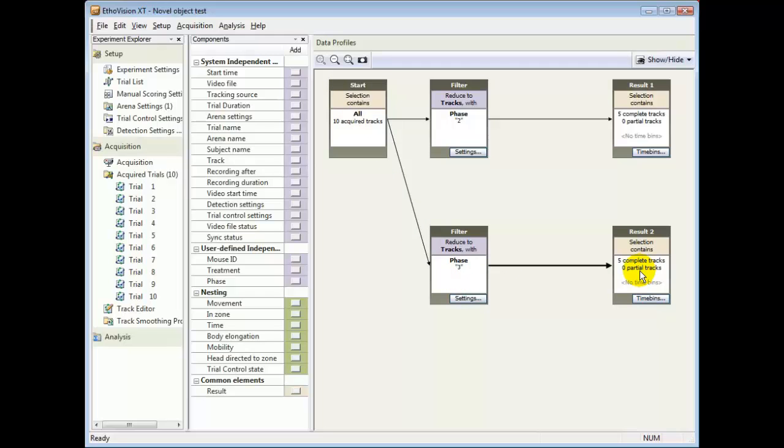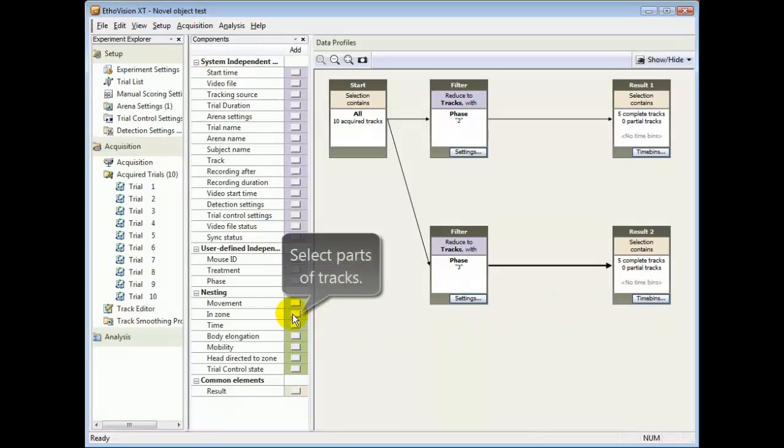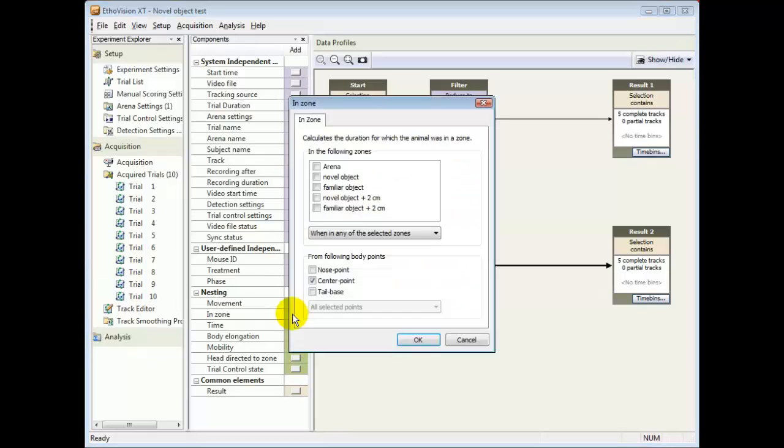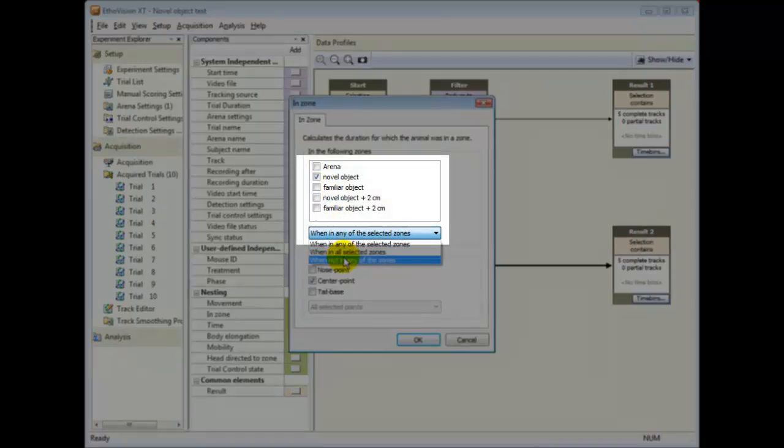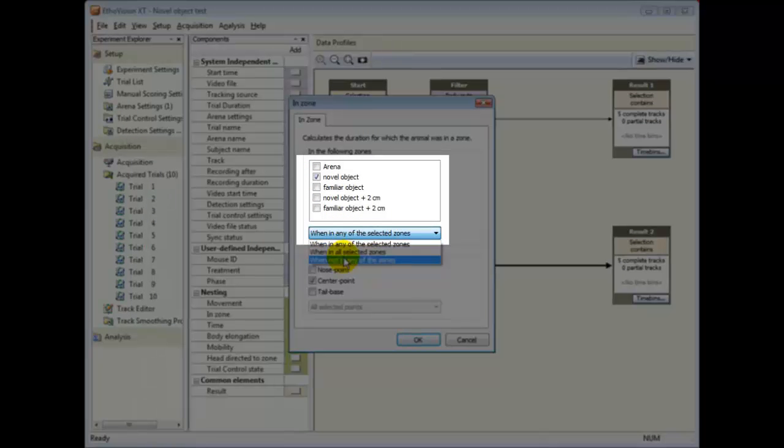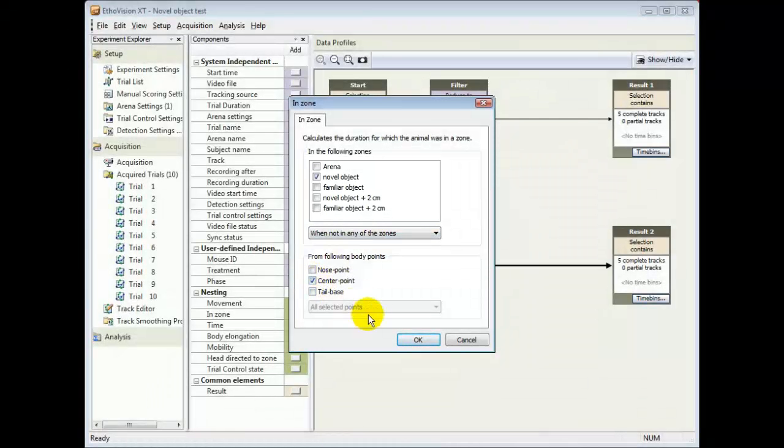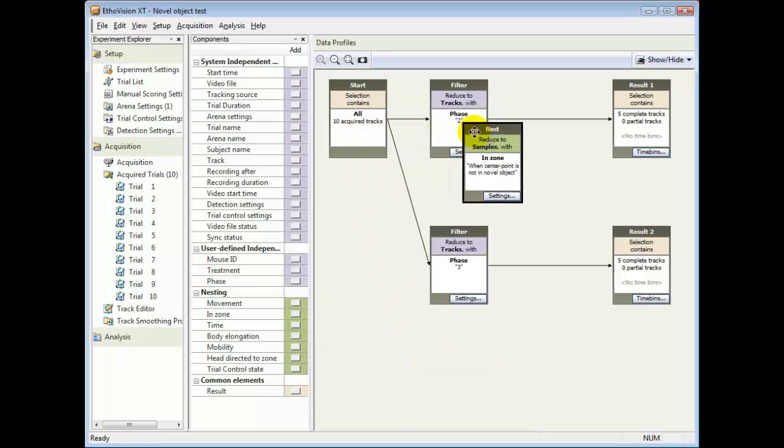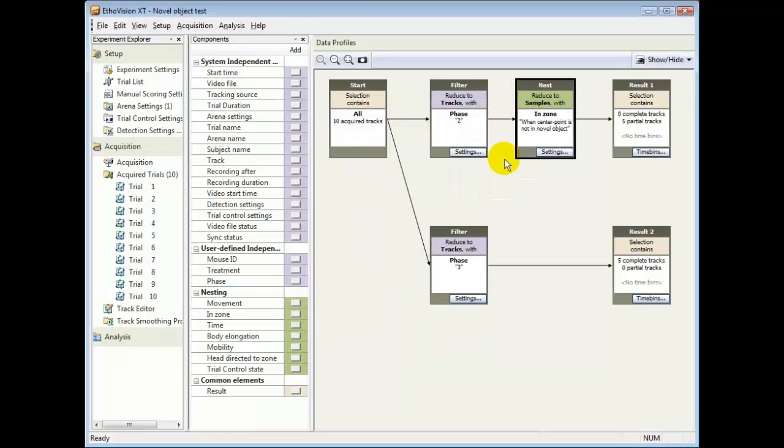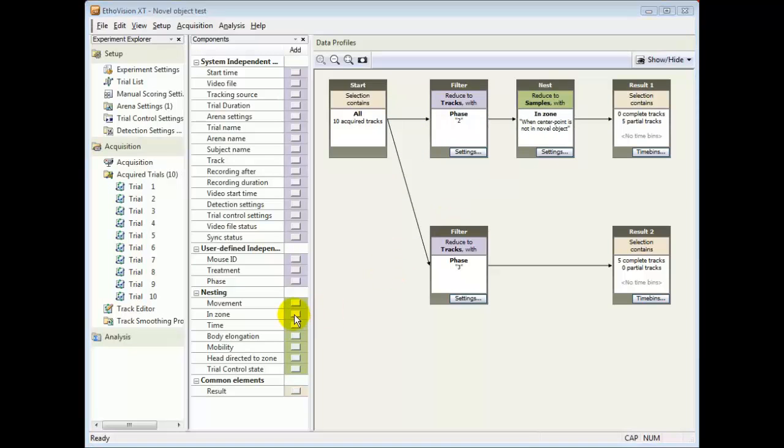You can also select parts of tracks by making nesting criteria for the dependent variables. Here I exclude the data from when the mouse was sitting on top of the novel object. The criterion is when the center point is not in the novel object zone, and I repeat that for phase 3 results.